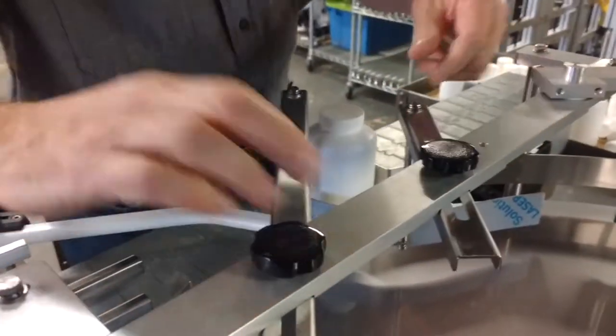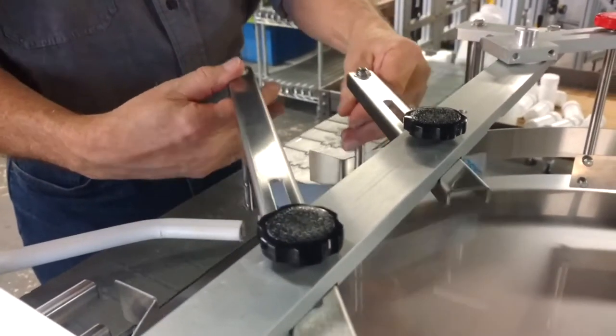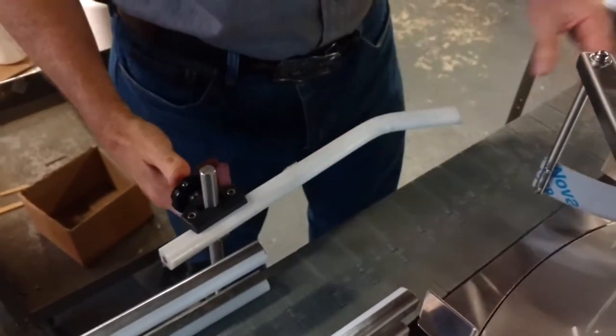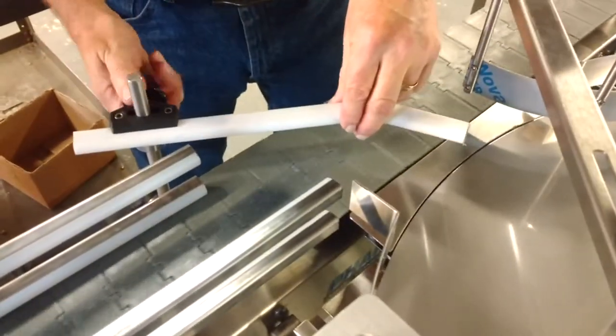Same with these here, depending on the width of the bottle — open for bigger than you need and then pull it in for the small bottles. This gate here will be opening it up to let stuff bypass, or bring it in here and adjust again for the small or large bottles.